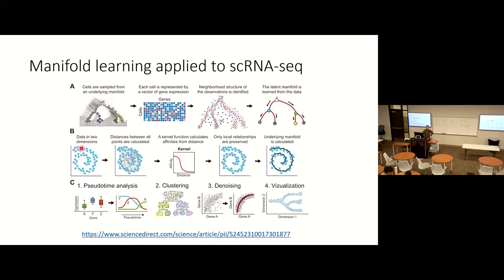Okay, in this shape you can see there's a structure, and if you build a network and trim the network and only keep the so-called KNN, you can transform this. If a link is too long, then you can trim off the link between them.